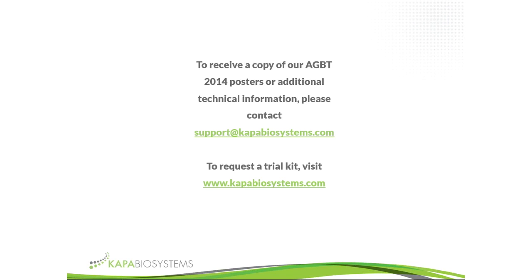Okay, one last question, which is, will Hyper Prep kit work with Agilent Haloplex exome capture kit? We've not looked at Hyper Prep and Haloplex at all. I need to think a little bit about the mechanism, and please send us your email address so that we can follow up on that question. We do know that it will be compatible with the SureSelect kits, but Haloplex, I have to think about a little bit, and we'll get back to you with a more detailed answer on that question.